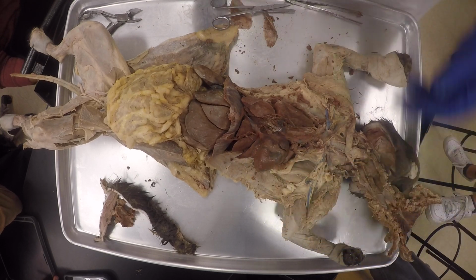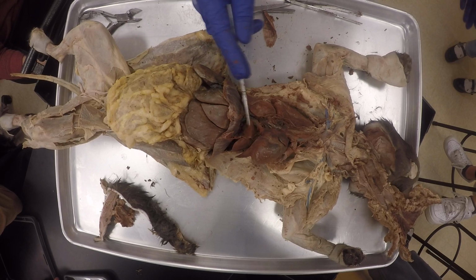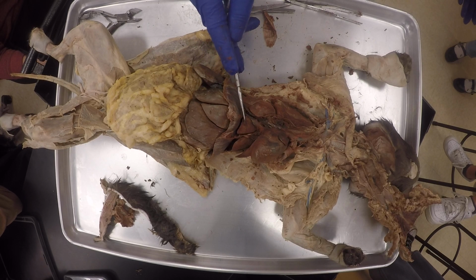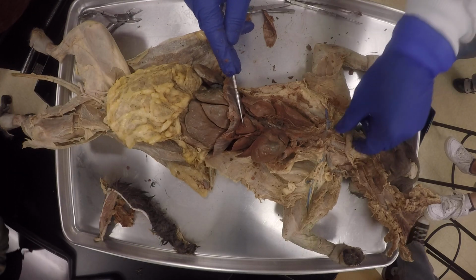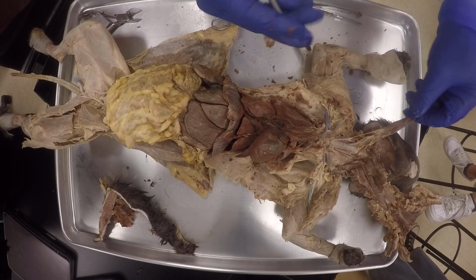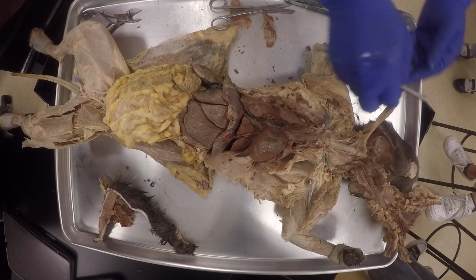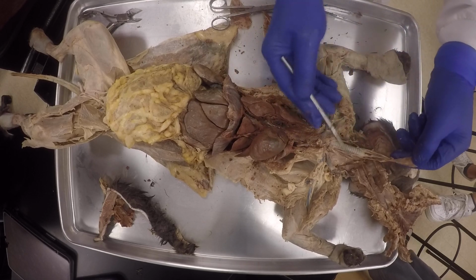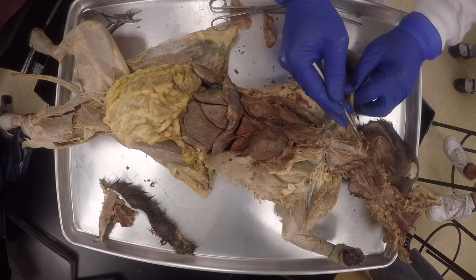Okay, very good. The intermediate lobe is one that I haven't been going on. That's the seventh one, the intermediate lobe. Do you see it? Okay, so I'm going to leave my thymus attached here, which was like that. Do you understand? I'm going to leave it like that, just so that we don't forget about it and throw it away with the tissues and stuff.